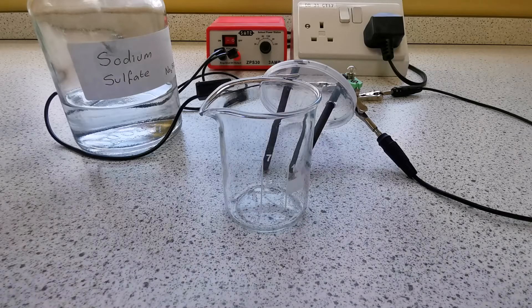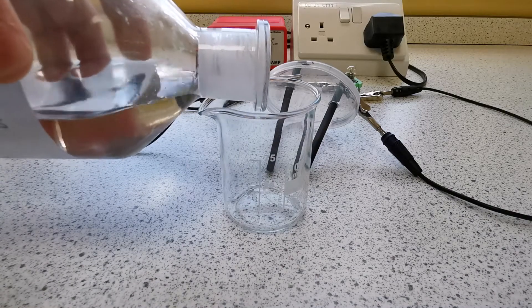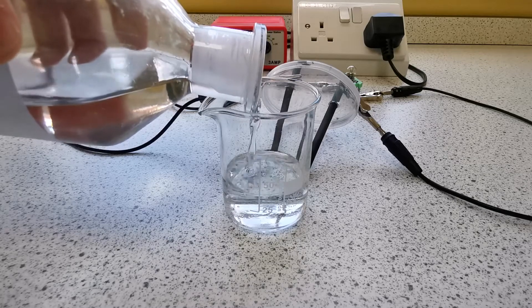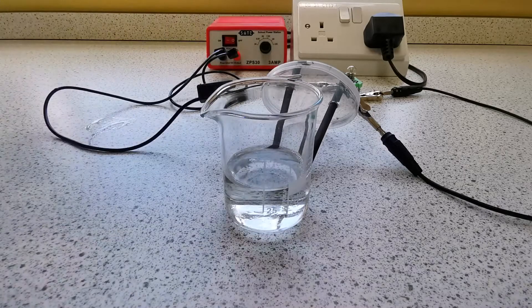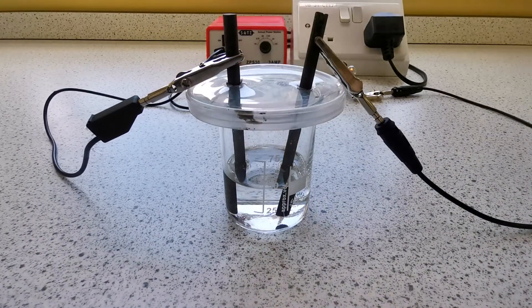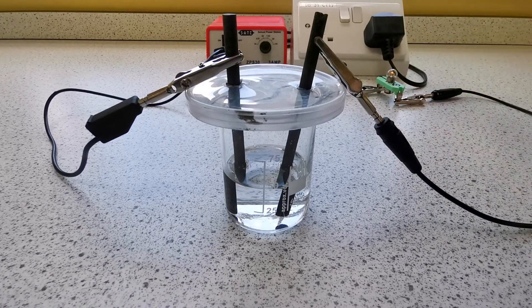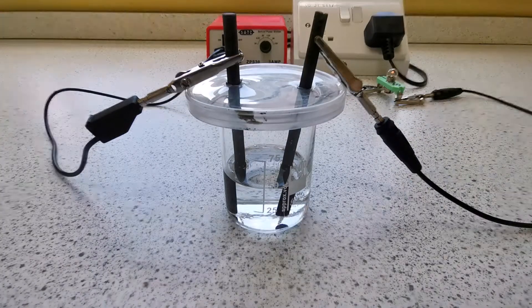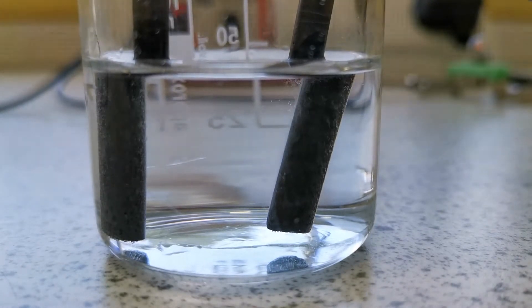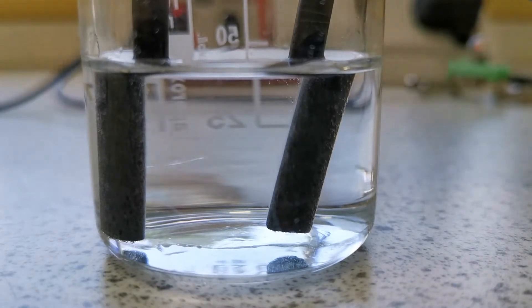Now I'm going to repeat the same method with sodium sulfate solution — 50 milliliters once again. I'm going to put the electrodes in and turn the circuit on — you can tell the circuit is on because the light bulb is lighting up. As you can see, once again we have two gases being produced at the anode on the right and the cathode on the left.